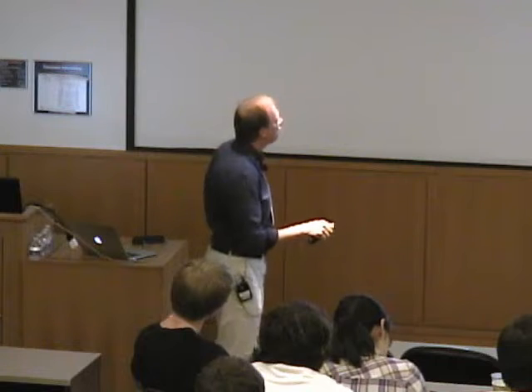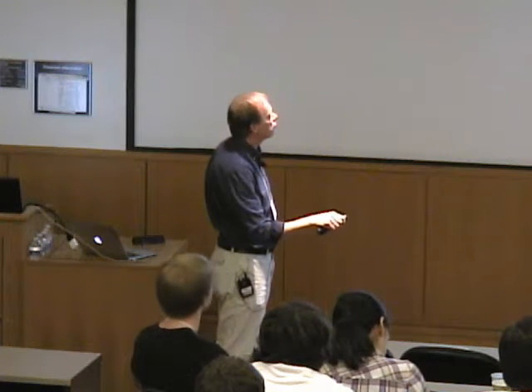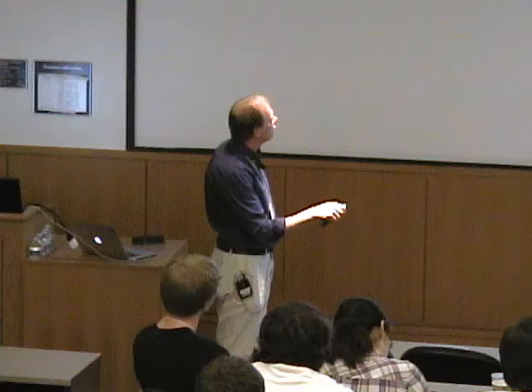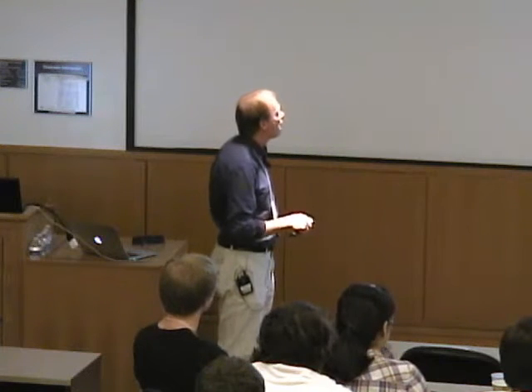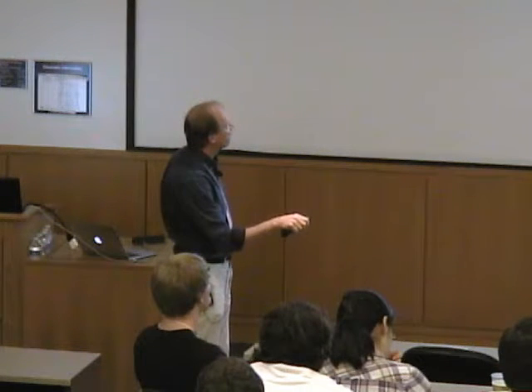So if we're sitting over here, our field would be oscillating back and forth, and the signal we would get would oscillate up and down. If the field goes back and forth between these two values, the signal goes up and down between these two. Then when we're over here, on the other side of the signal, we would get a bigger change. And so we can use the height of this oscillating signal as a measure of the amount of absorbance here.